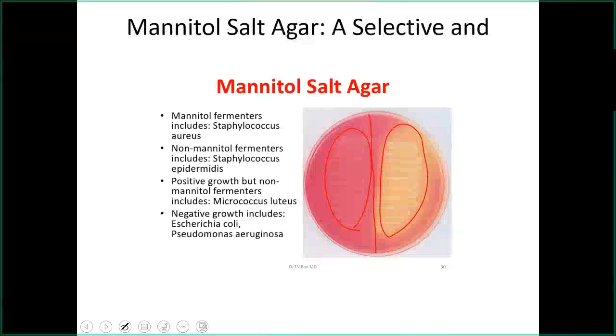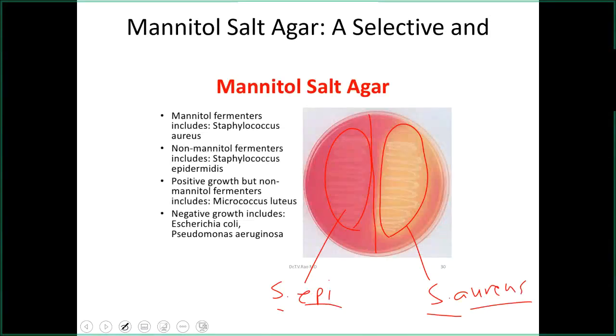So this side is probably Staph epidermidis. Of course, that's more than likely Staph aureus. So there's that. Okay.